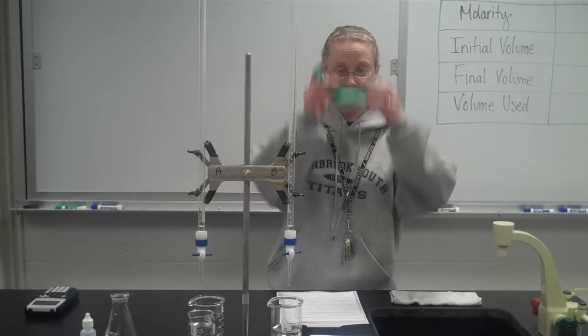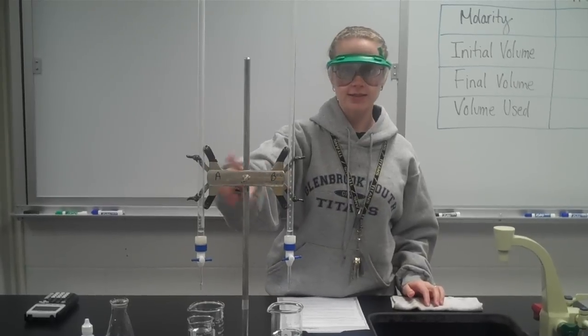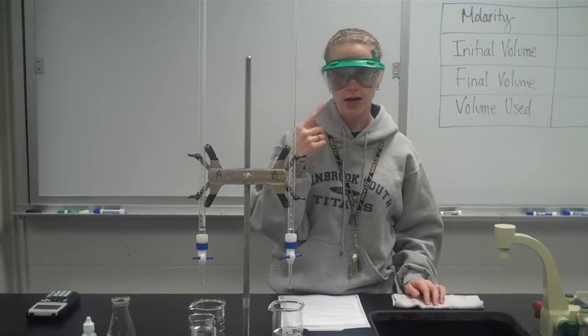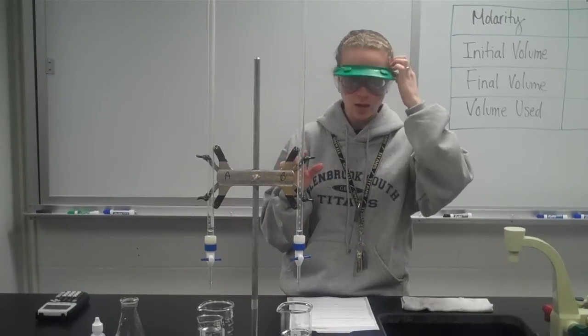Step one is always put your goggles on for safety. We're working with acids and bases, and both of them will hurt your eyes if they get in them, so make sure that you have your goggles on before you do anything.